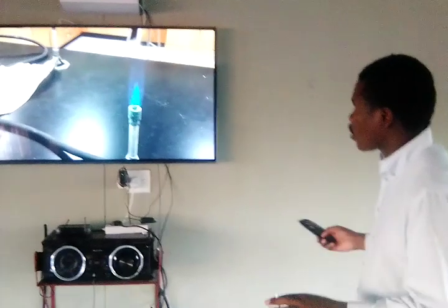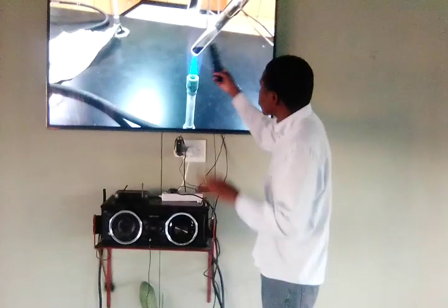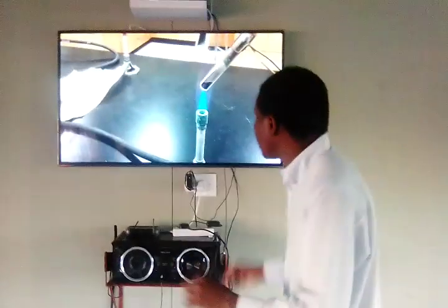We are now reaching the end of the experiment because now we have been able to see the product, to see the color of the product. It's almost a black substance, right? A black substance, a black powder remains. Initially, what was the color?